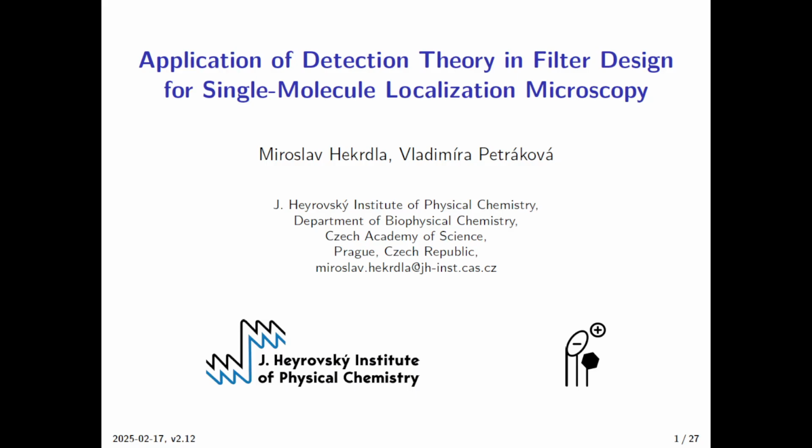The aim of my talk is to introduce you to the content of our recent article. The topic is about molecule detection for single molecule localization microscopy.